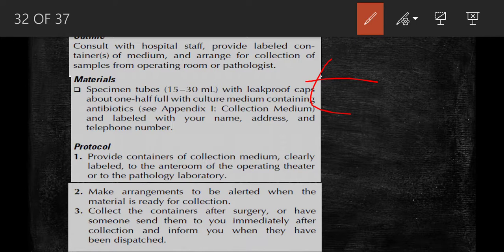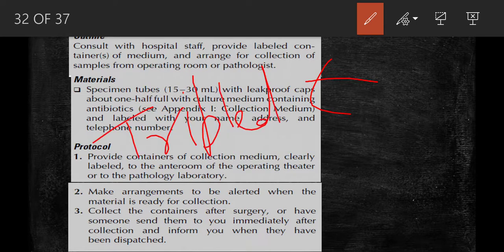For the protocol, give the container with collection medium to the operating room or pathology laboratory, then collect and transfer the sample to the tissue culture lab. The sample should be triple wrapped.